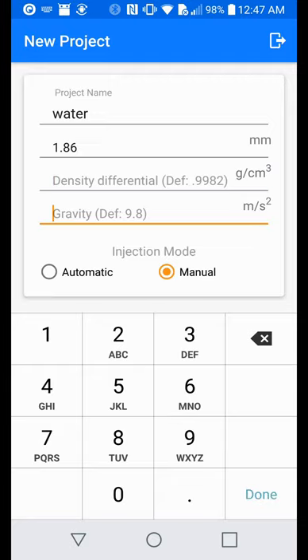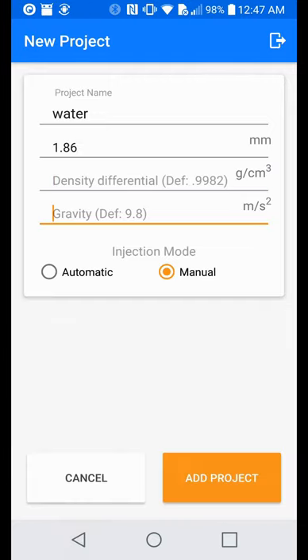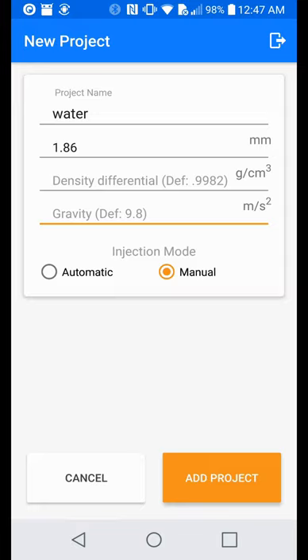In this case, since it's water and air, we can leave it as default. The acceleration due to gravity can be left as its default value. And depending on the unit you've ordered, either automatic injection or manual injection.